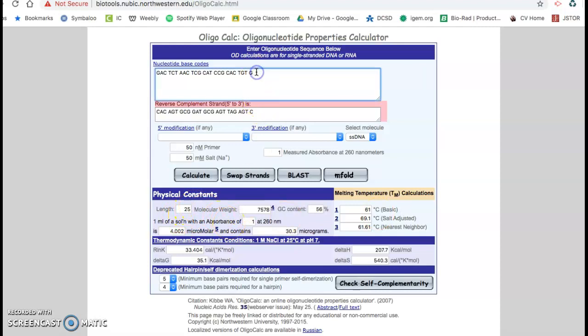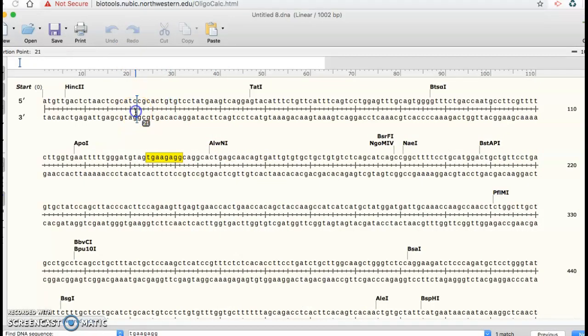I would actually probably go back and just finish it right there. I'm close to 60 degrees. It's not ideal. What I might actually do is grab a part of the sequence that's further back, or maybe a little bit further forward, until I got something that's pretty close to 60 degrees. The closer you can get to 60 degrees, the better, right?